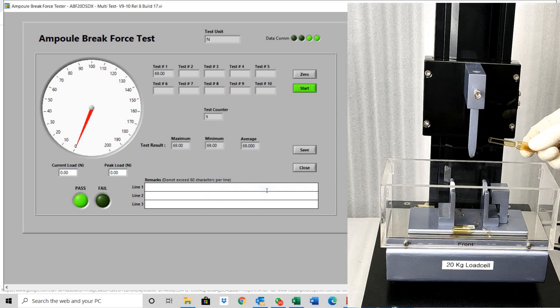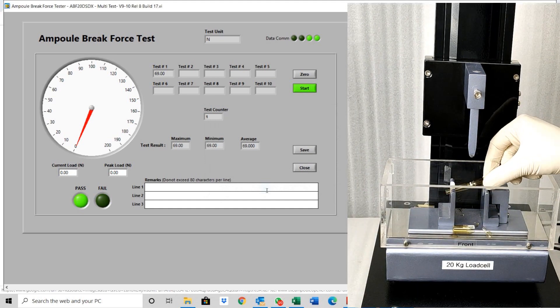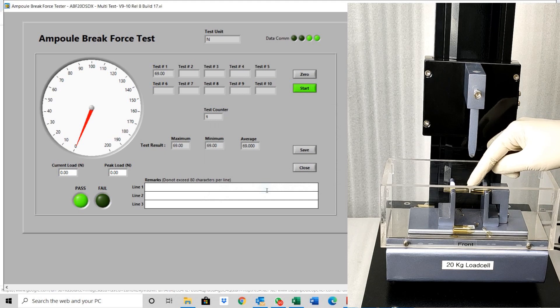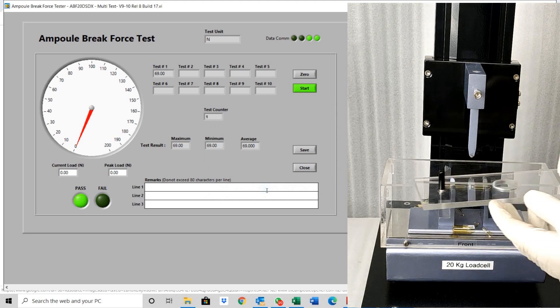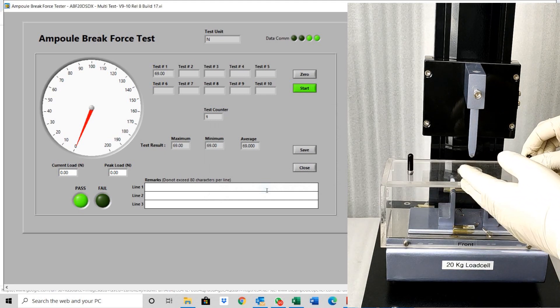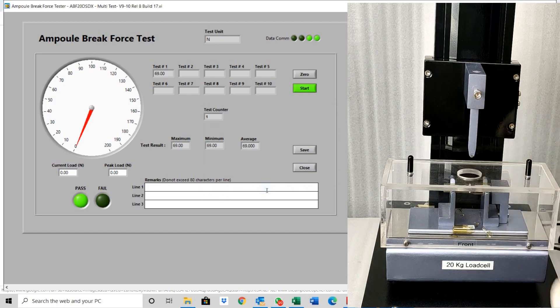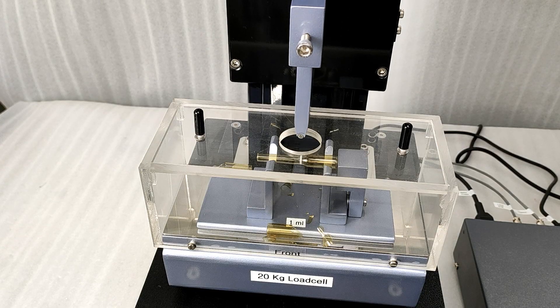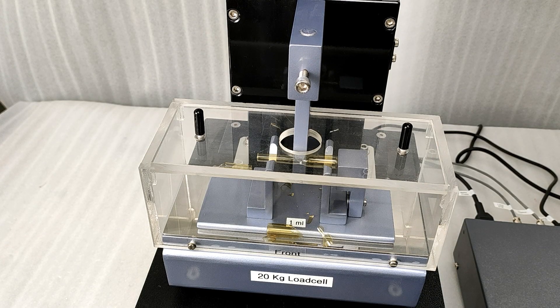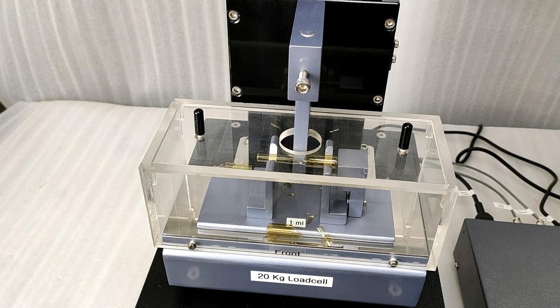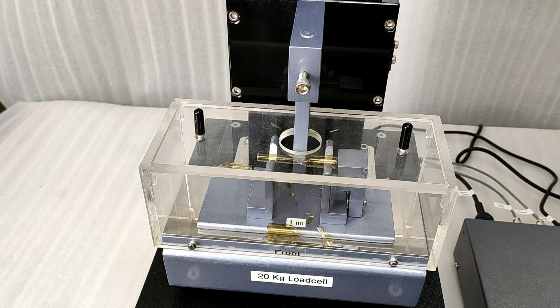Place another sample and test all remaining samples this way. Select normal or abnormal after every test.